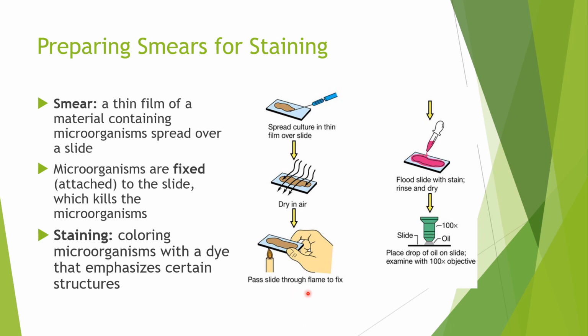After you heat fix, and by the way, are there certain staining procedures where you must skip this step? Yes. There are certain procedures where you should not heat fix, and we'll explain later, and I'll tell you when you shouldn't heat fix.